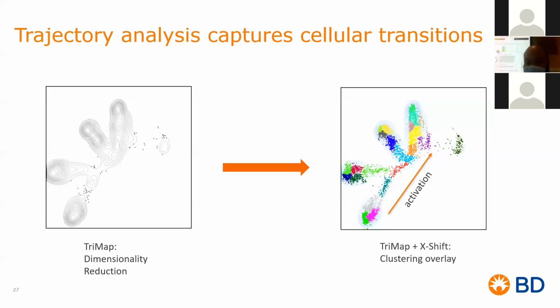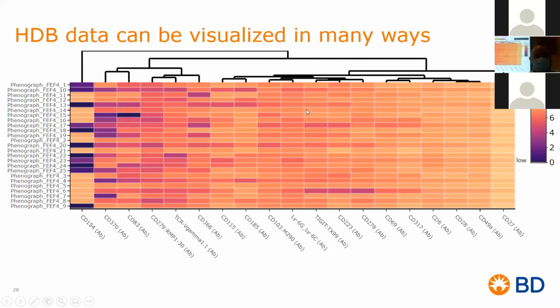Here we go. How to tell the direction. So that one we have to do an analysis into each of the major clusters. So let me show you how I did that. That's essentially it. I then generated a heat map, and this is using our plugin called Violin Box.